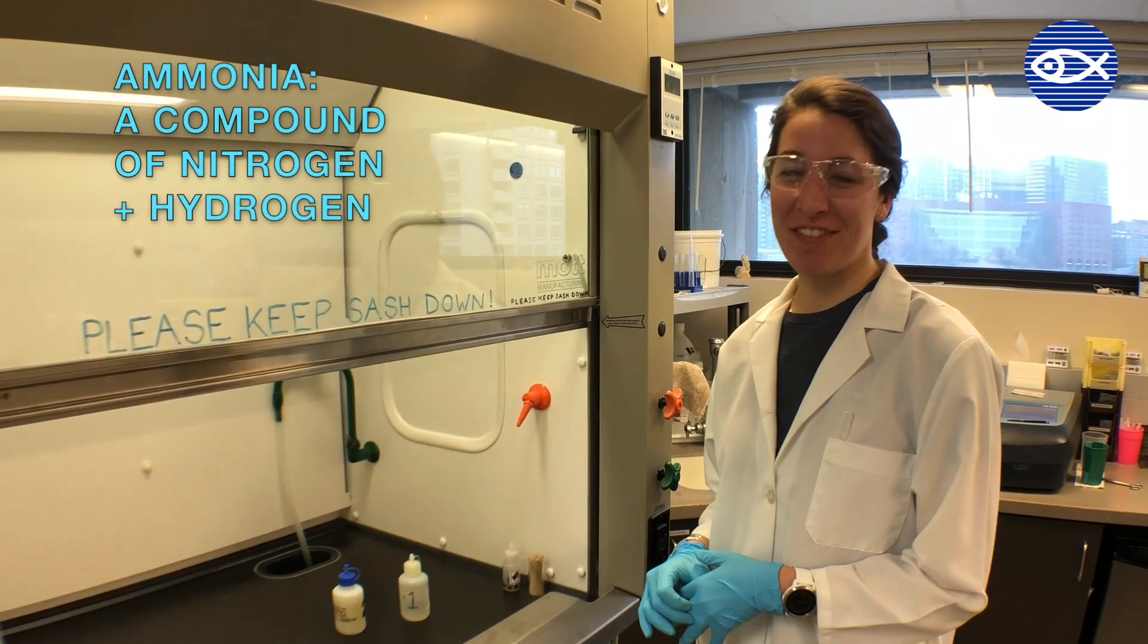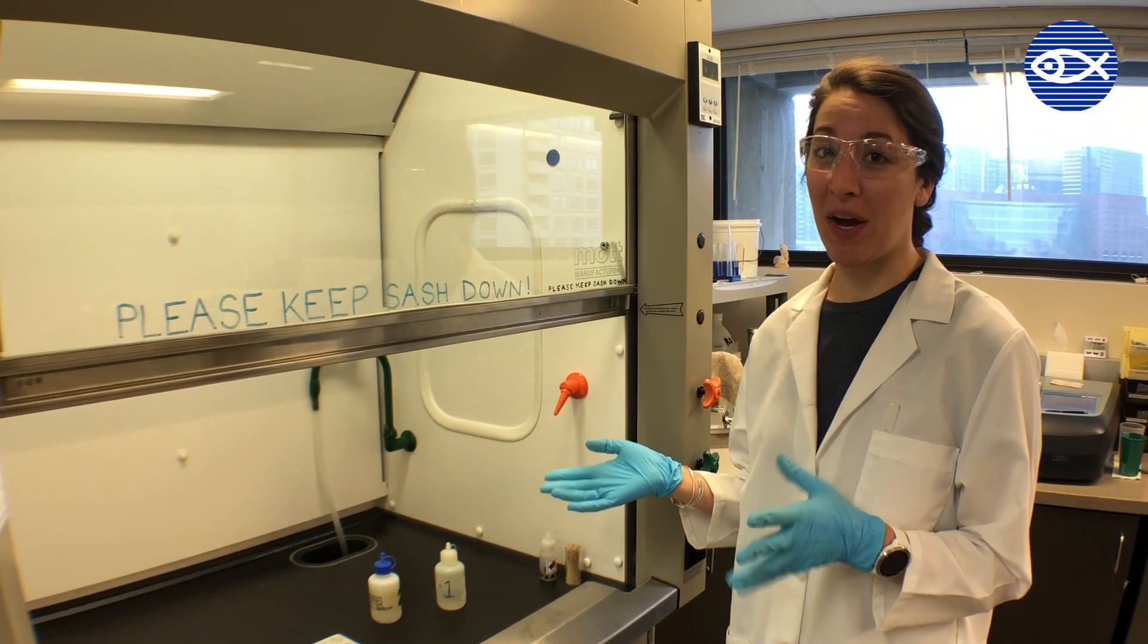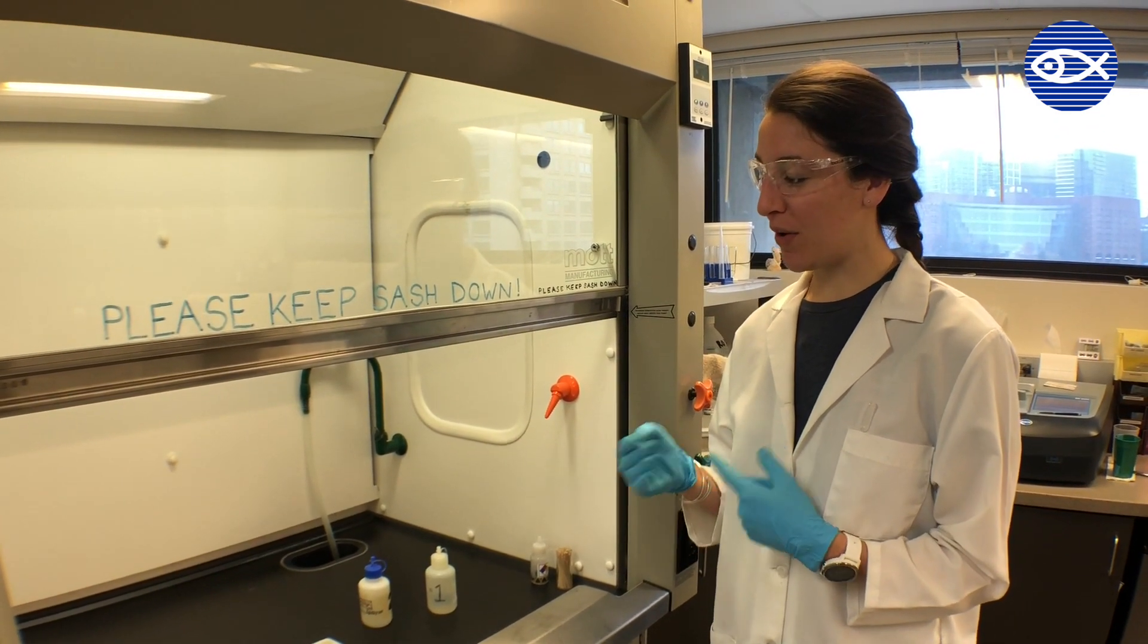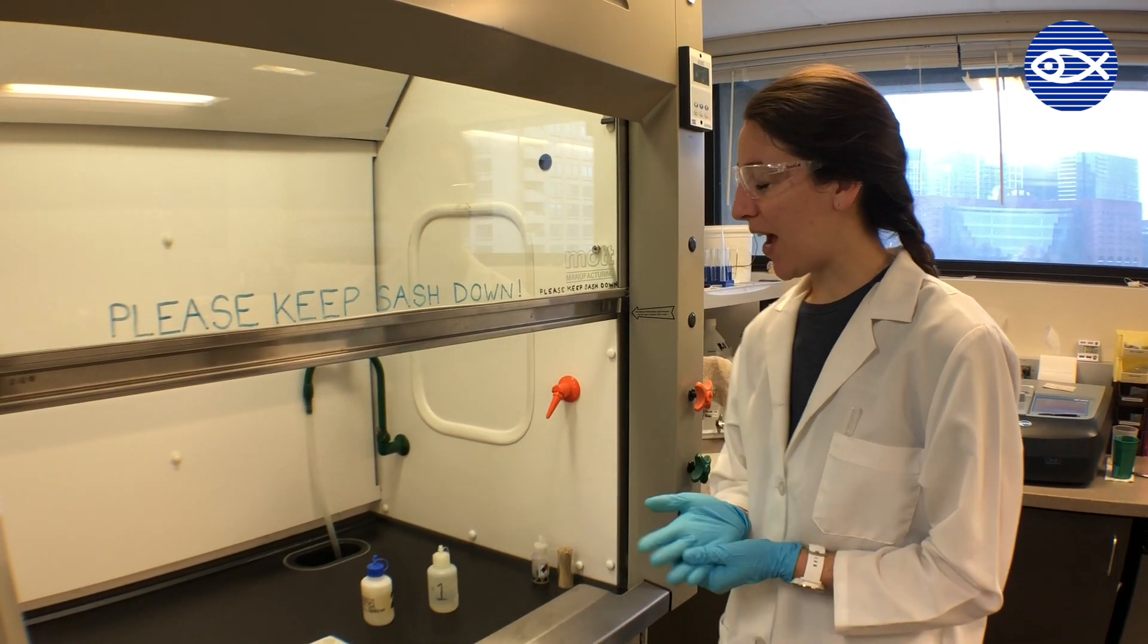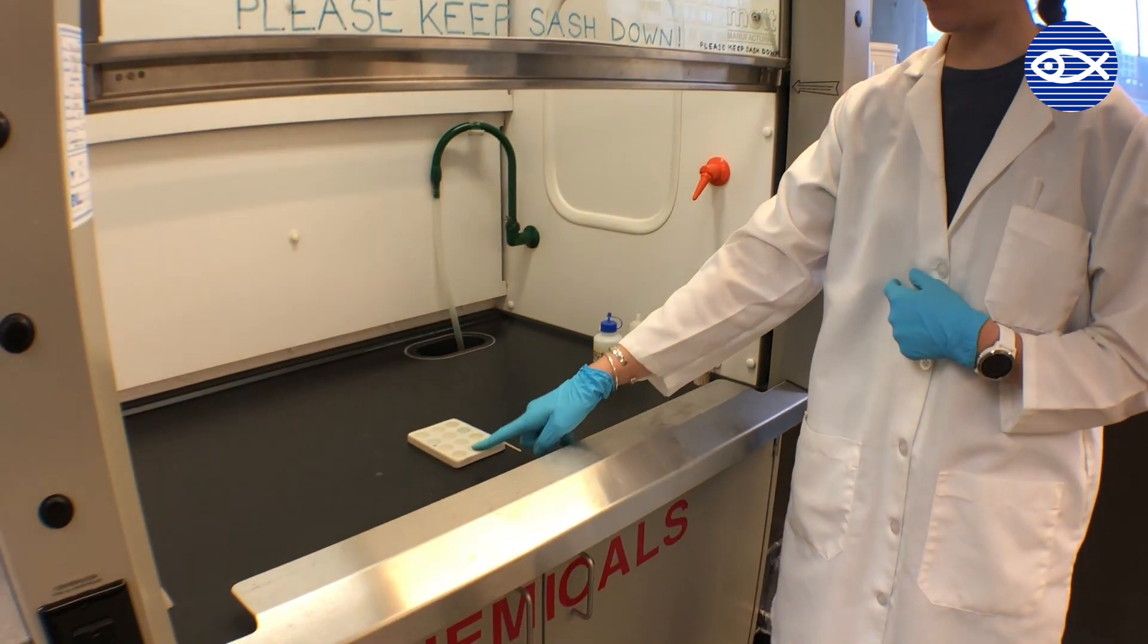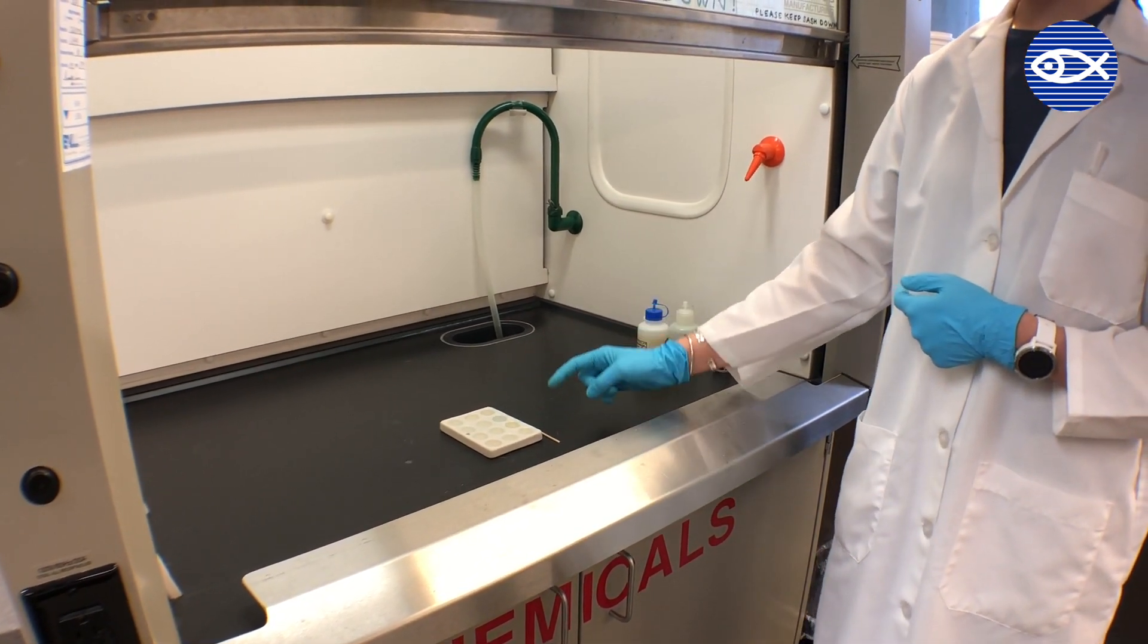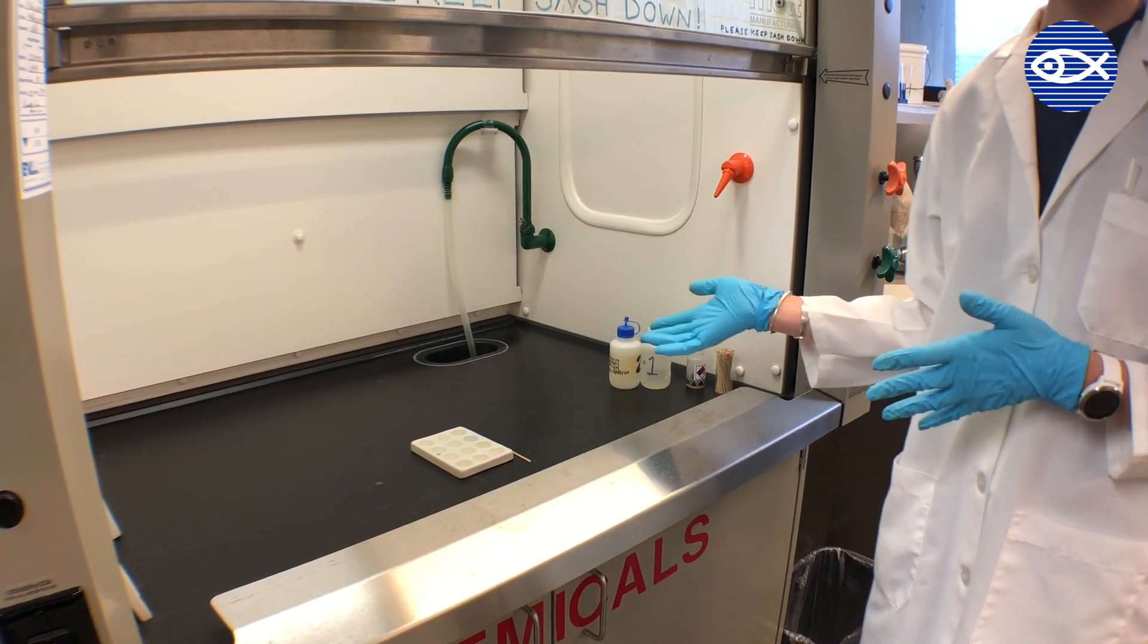So when we run ammonia for all different systems, some days we get over 30 or 40 bottles of water from different tanks. The ammonia test is about a 20 minute test, so we don't want to have to run that for every single system. So what we do is we set up a screening plate. We put each sample, a little bit of gallery water or tank water, in each well. Then there are three different dropper bottles that we use. Depending on the color that it turns, we know that there's more or less ammonia in that system.